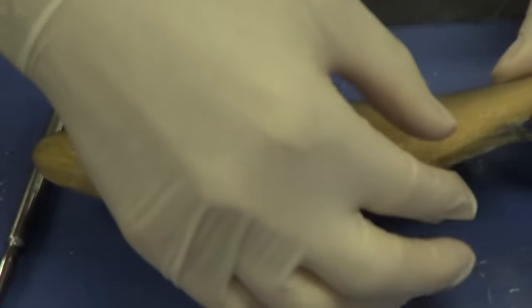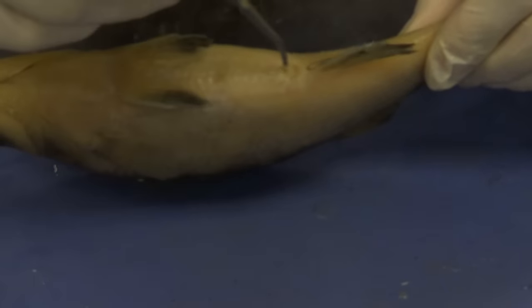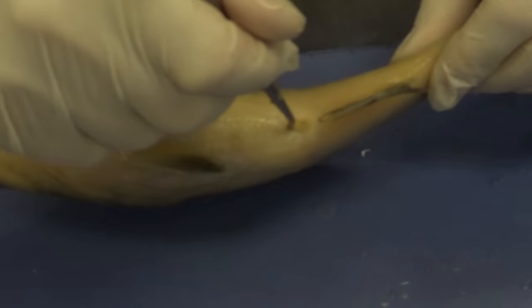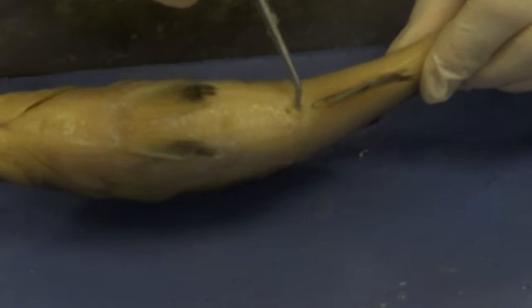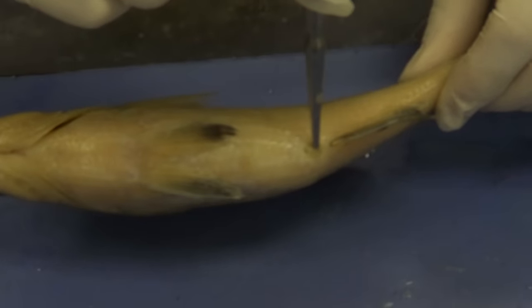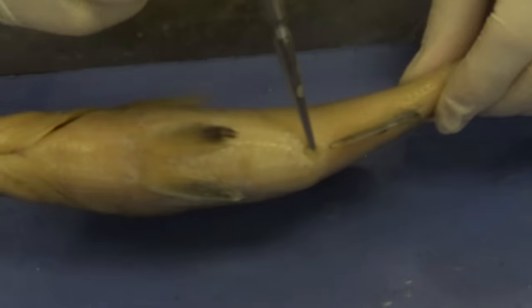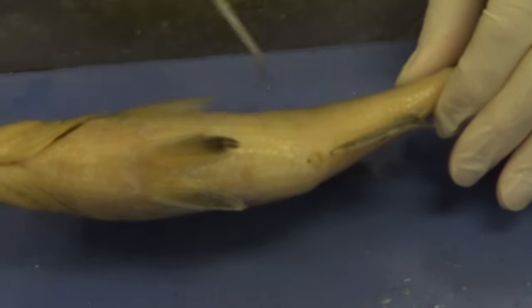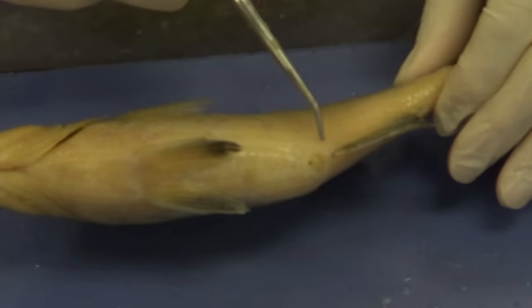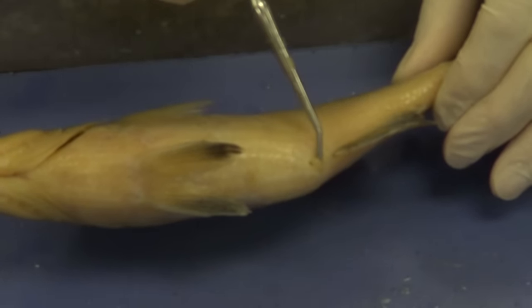We've also got another fin here — this is the anal fin, because just anterior to it we have an opening, which is the anus. Just a little bit more posterior, we have another opening, which is the urogenital opening. As the name implies, 'uro' refers to the urinary tract and 'genital' to the genital tract. Since this is a male, this is where the sperm would come out, and the urine would also come out. So that's the urogenital opening.